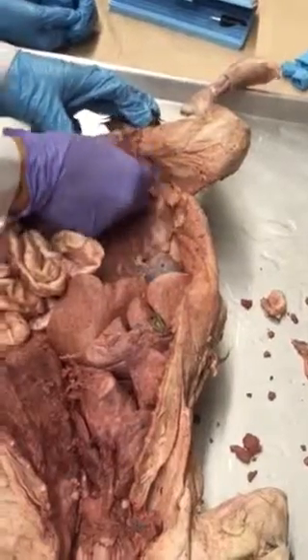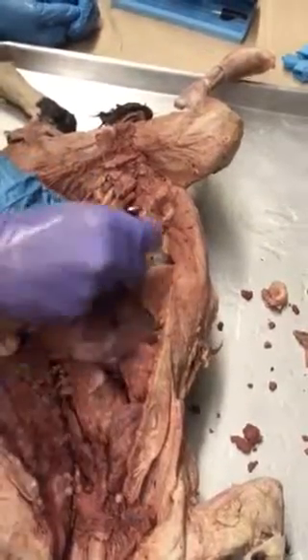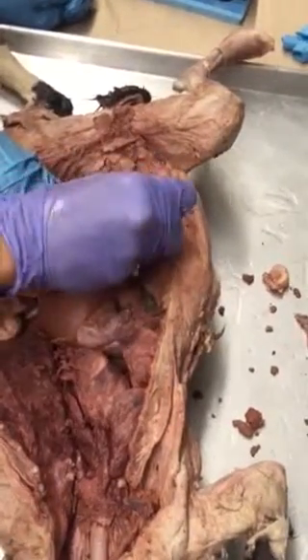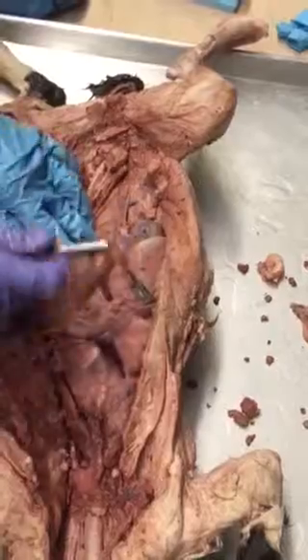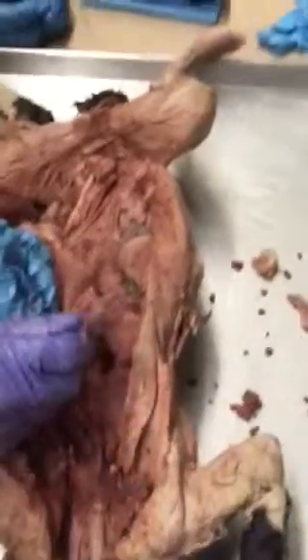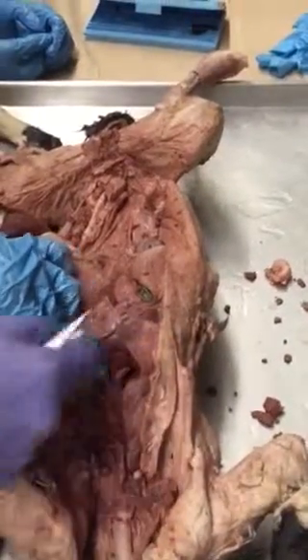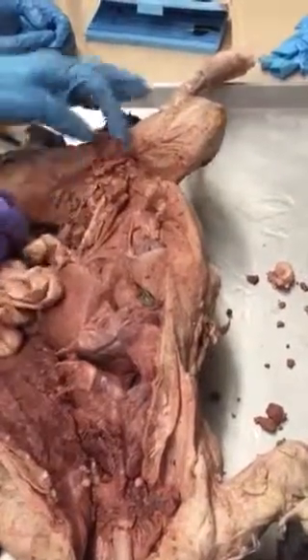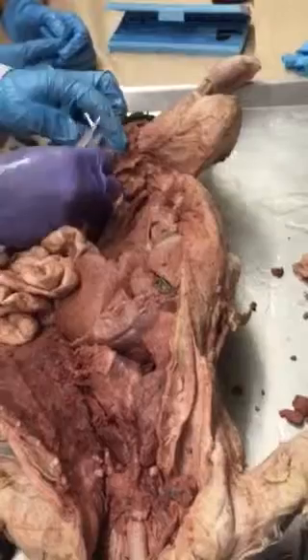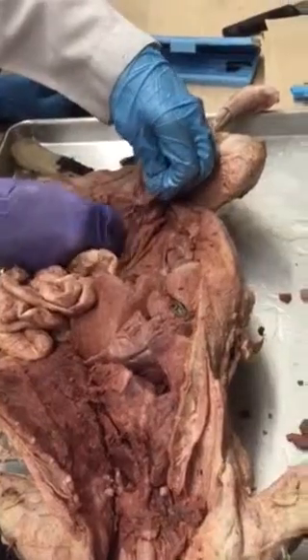Let's see. Over here, adjacent to the kidney, you can see the inferior vena cava. And this will continue all the way up to the heart. Yeah, sometimes you can see it up here as well. If I were to dig around, I could probably dig around in there and pull it out as well. But sometimes I can find it nice up here. Sometimes I find it nicely down here. All right, and then let's see. So we can find one more.